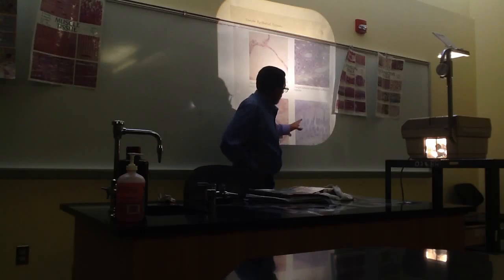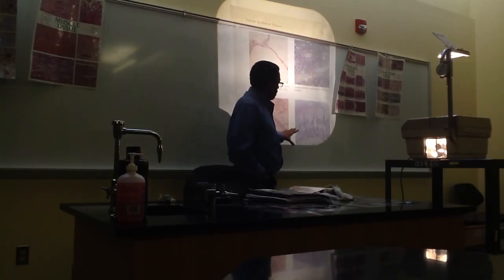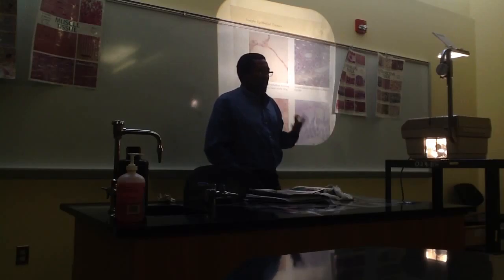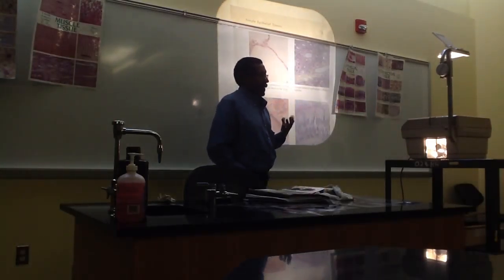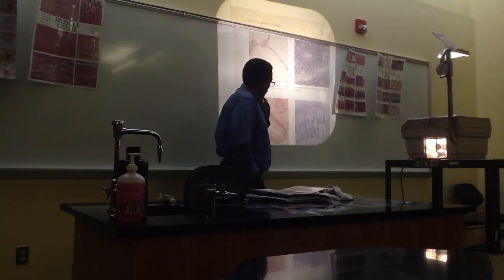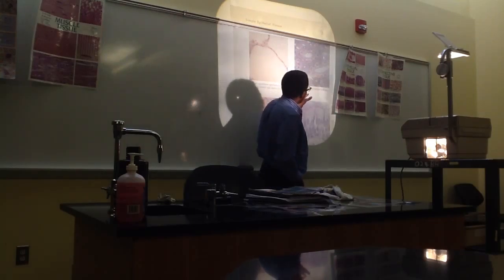So everybody's familiar with this one. Under your microscopes, this is at a higher power magnification than what you will see in your scopes. This is greater than 400x. So it's important that you look at everything at 400x, because that's what you're going to see on the lab practice. Okay, you can see why this is simple cuboidal.